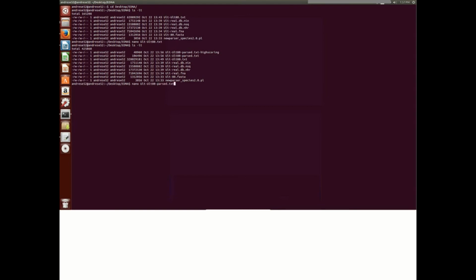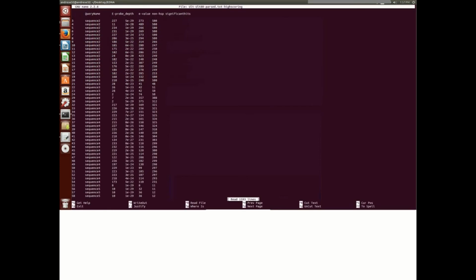that text. And this is going to be raw data if I put that text. Oh, well, that text high scoring. Sorry, there's a typo there. So it will show me a previous view of what I'm getting. And again, I'm getting the same thing as I showed you in my other folder.